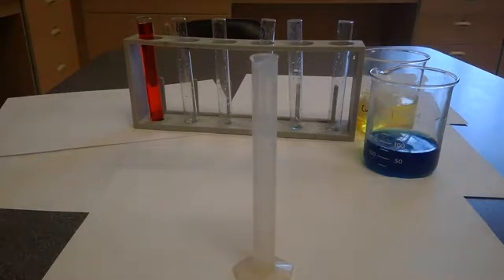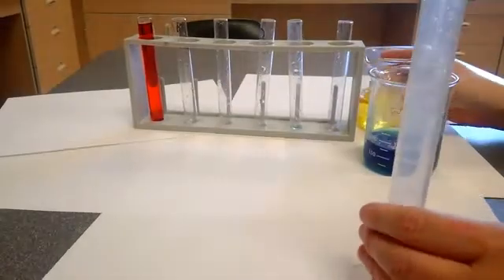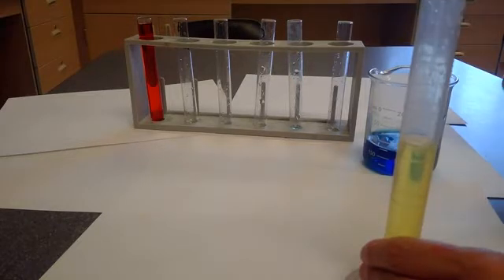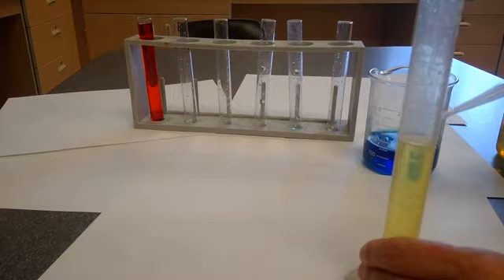Step 4 said that into test tube C, I was going to put 18 milliliters of yellow water. So again, this one is too small, so I have to use this one here. Using the same method I used previously, knowing that this has increments of half. So if this is 20, this would be 19 and 18 is right here.